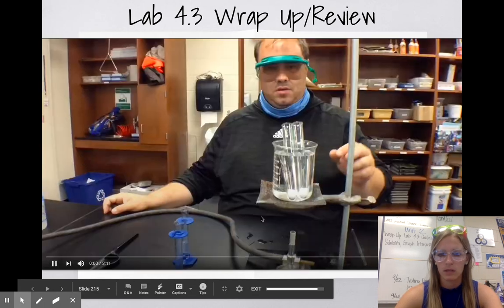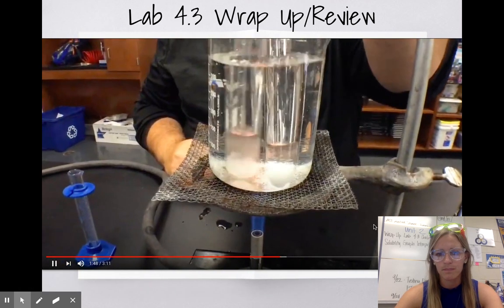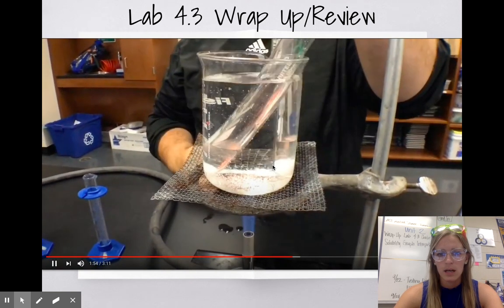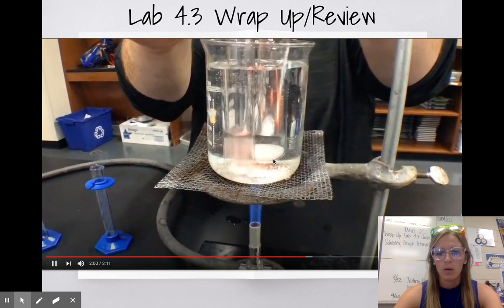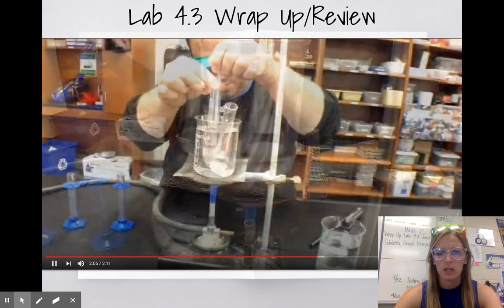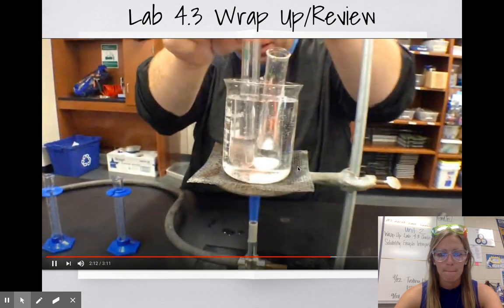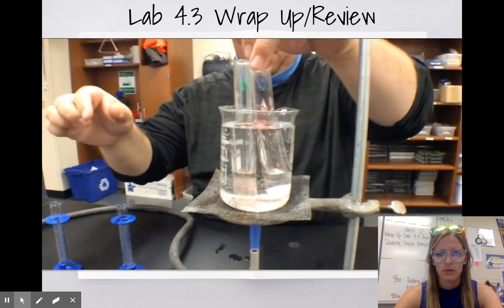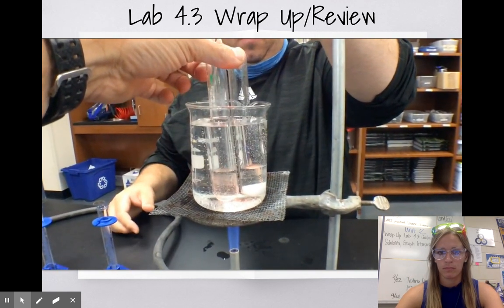So if I play the video here, I'm going to move us up to about here so that we can see the end result. As you're watching this, you can see that one of them is dissolving more than the other. This one should have been our potassium nitrate and this our sodium chloride. We are heating up the solution, so we're increasing the temperature of the solution, which is allowing it to dissolve. At this point, one test tube has completely dissolved, and then we remove our rod.